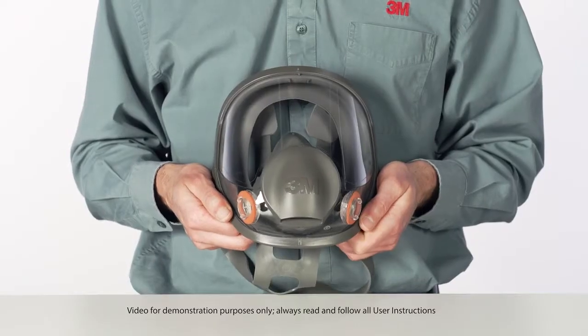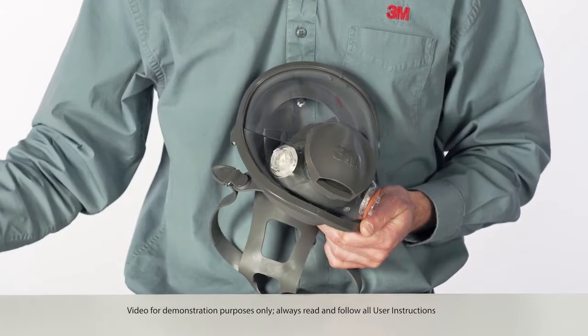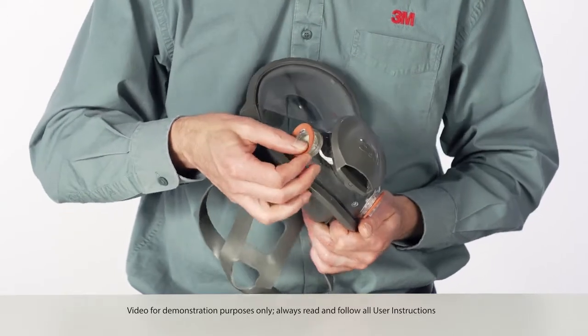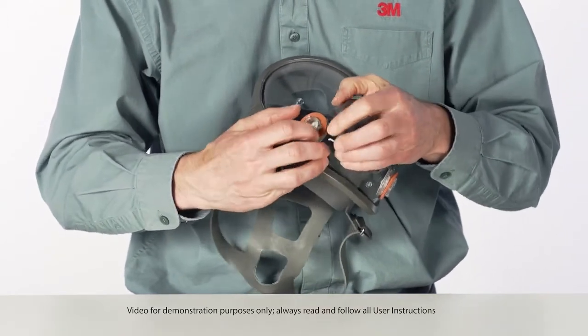Remove gaskets from bayonet fittings. Install new gaskets onto bayonet fittings. Be certain the gaskets are in the proper position under all three bayonet lugs.